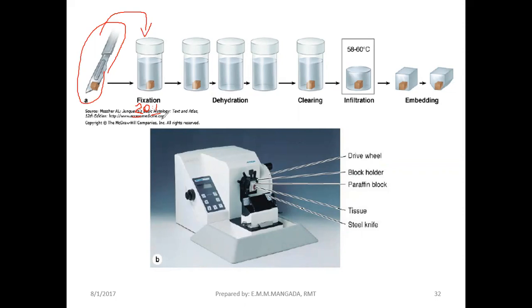Dapat ang volume ng ating fixative is 20 times than that of the volume of our tissue. And then after that, we have dehydration. So guys, now if you can see here, we have three containers. Bakit? Di ba, sa dehydration, using your alcohol, specifically your ethanol, we're using there increasing grade of alcohol. We do not immediately proceed with your absolute.